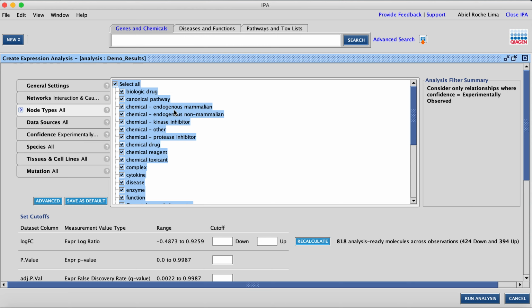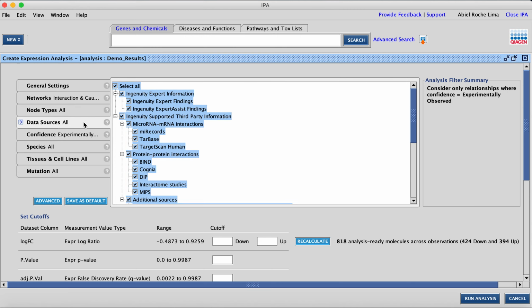Usually, another terminology that the community uses is fishing. We are fishing the information as much as we can get of the list of proteins that we want to enrich. So most of the time we leave this as default because we are just exploring the list of proteins we are analyzing.